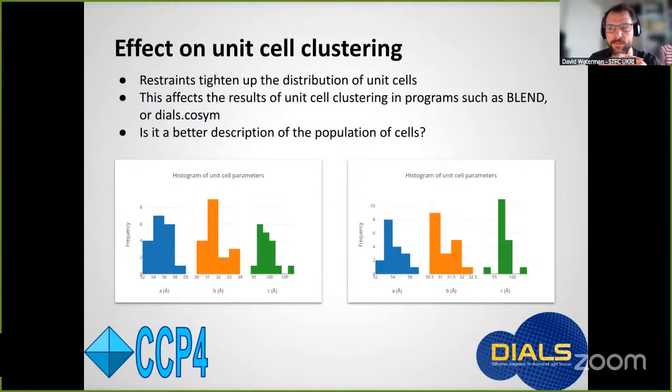If you collect the data all on the same day, one after the other, without changing settings, then the detector distance should be the same. So I guess with anything, I would say if you can, you should try to determine the detector distance really accurately, calibrate it with a very good diffraction standard. And if you know that it does not change, does not drift with time, then determine it and fix it and keep it at that distance and don't let it refine.